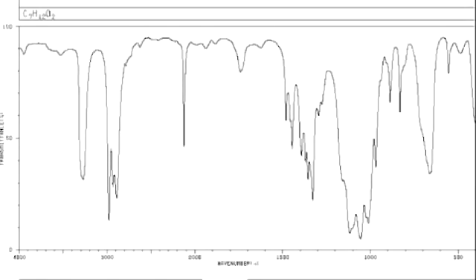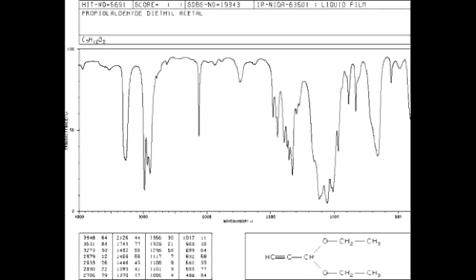All right, now looking at the structure and formula of the molecule, we can see that we do in fact have two oxygens in this molecule, even though it doesn't look like it from carbonyl or alcohol absorptions, because they are in fact C single bond O ether-like bonds that are part of an acetal. And we can confirm that by looking at 1200 and 1100 and seeing those C single bond O stretches there. We also see that there is a terminal alkyne in this molecule.